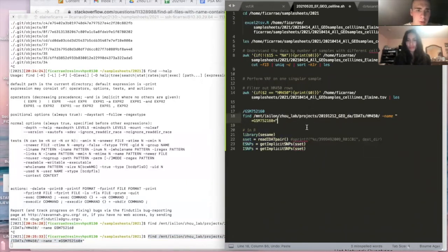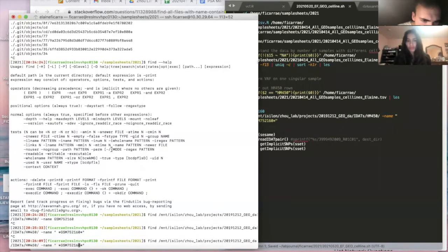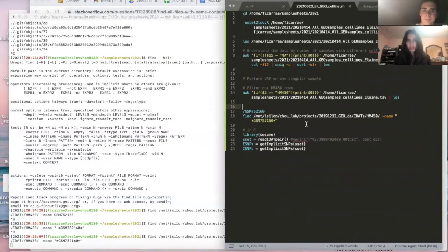Otherwise, I'm not sure what we're gonna do, because I don't know how we can view the files in this directory because it's probably so large. I might do some hunting on my own to figure this out, because it's ridiculously large.